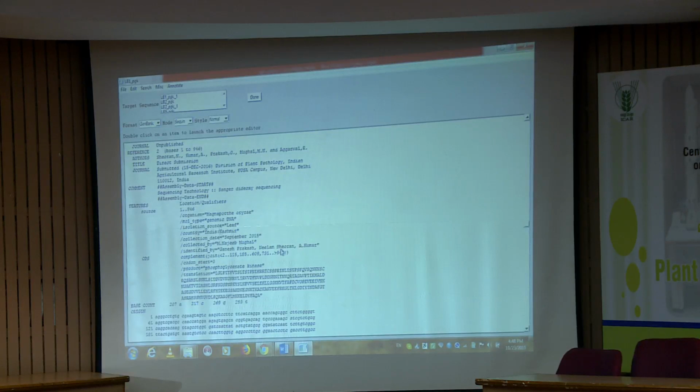This is for all types of genes, whatever gene sequences we are submitting. Although for journals like bacterial identification and fungal identification, there we do not have to specify because that is the universal marker only.